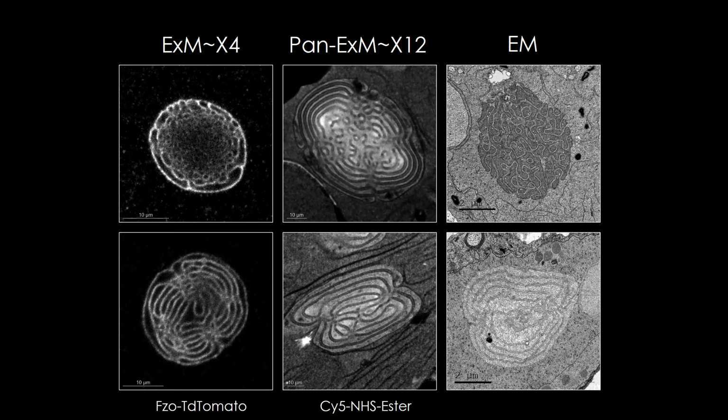You should use really fresh materials and not wait too long at different stages. This is also the reason why you shouldn't use too many samples. If you're too ambitious and use too many samples, sometimes you mess it up and end up with a less desired result.